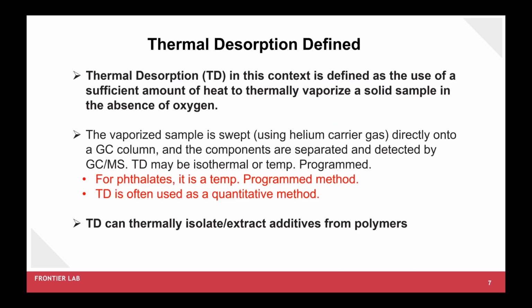One of the traditional techniques for analyzing phthalates is solvent-based techniques to extract the phthalates from the polymeric mixture. The extract is then analyzed using GC or HPLC to separate and quantitate the individual phthalates. These traditional techniques are most of the time time-consuming, costly, and they do not always completely isolate the phthalates from the polymeric mixture. As a result, reproducibility and accuracy can become challenging.